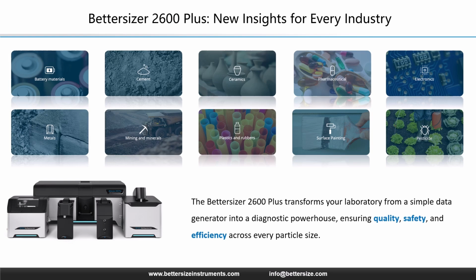In pharmaceuticals, we move from volume distribution to predicting bioavailability. By precisely measuring the fine fractions that drive dissolution rates and detecting the unwanted agglomerates that ruin content uniformity, we guarantee consistent drug delivery. In mining, we move from data silos to total process control. The sieve fusion function unites the mine and the mill into one efficient workflow.